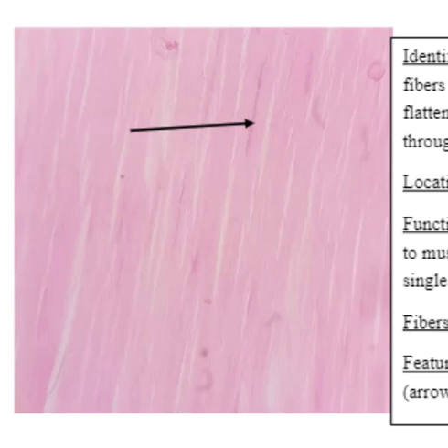The next tissue that we're going to look at is called dense regular connective tissue, and this is going to be your tendons and your ligaments. If you've ever been eating a hamburger or something like that and you bite down on a gristle, that's the tendons and ligaments. This is the dense connective tissue that you're biting down into, because when you take the meat, you're supposed to cut the tendons and ligaments off. And sometimes if they're in a hurry, they leave pieces of it and it gets ground up in your hamburger meat. So I always hate to get cheap cuts of meat that have gristles in it.